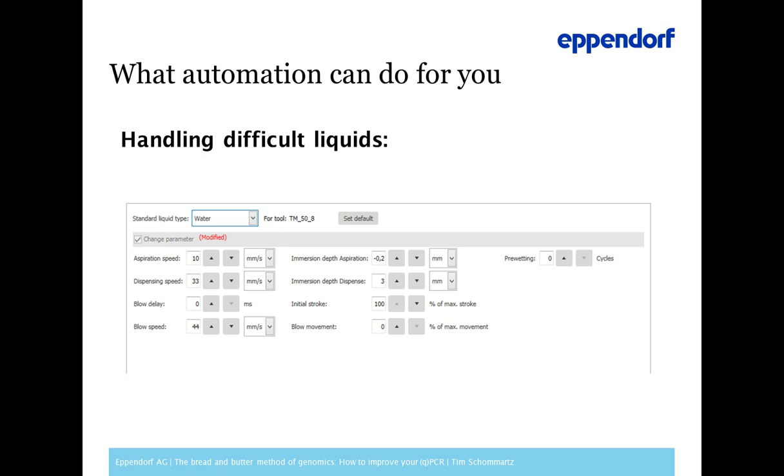Now, Tim, while we're on the topic of plates, what is a better plate, the transparent or white?